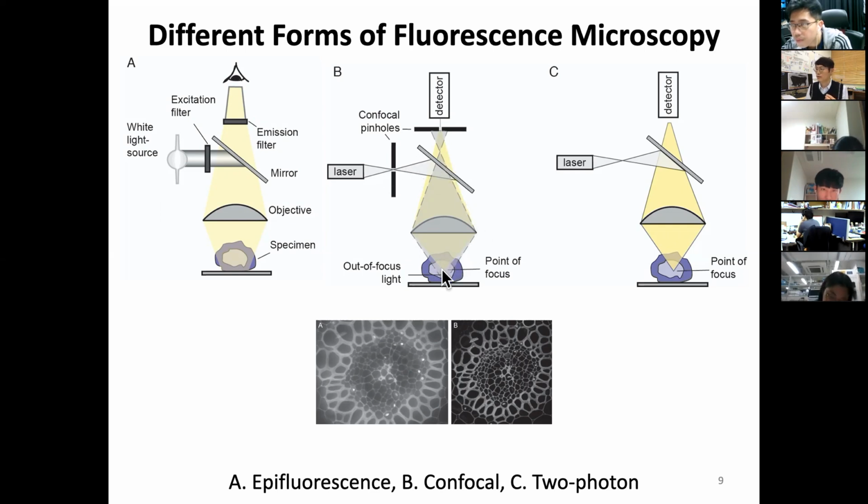So from the focus point, it forms a focus over here. And why don't we just pass this light through this focus, so that I make a hole over here, which is called a confocal pinhole? Then a lot of light can pass through, so I can detect it.